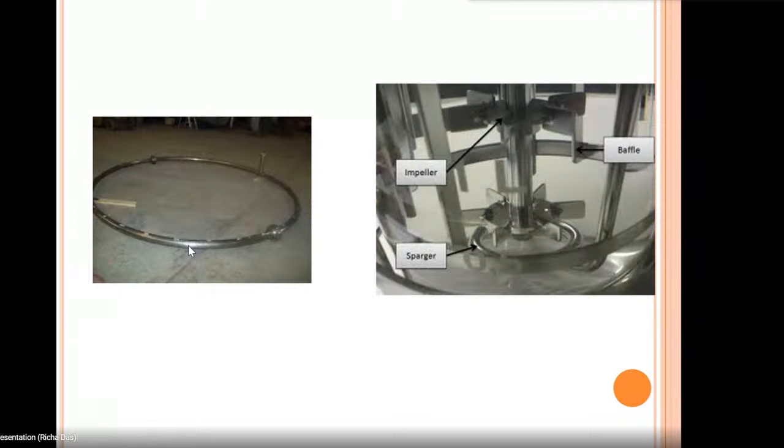High pressure is used to avoid contamination, and also to mix the contents, because when you introduce anything at a high pressure, the media will jump a little bit and can mix on its own as well. So that is why air and oxygen are always introduced through the sparger at a very high pressure to avoid contamination.